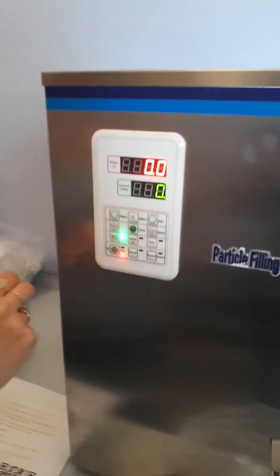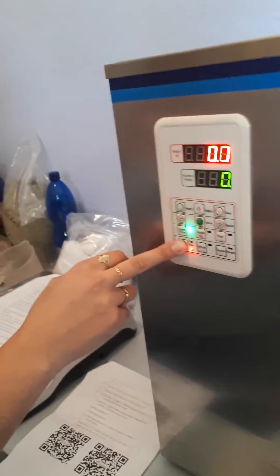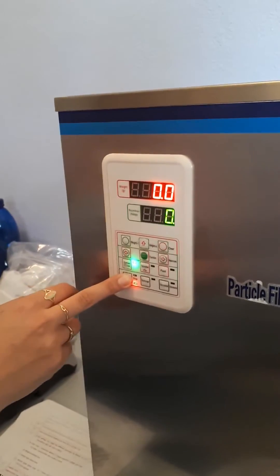We have three grams set on the scale and we've set the settings according to your instructions in the document. But when we start the machine, this is what happens.